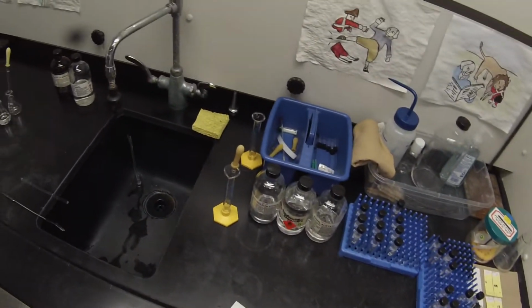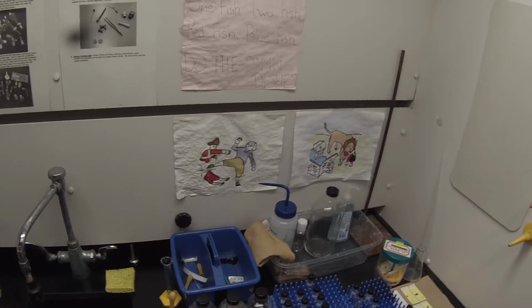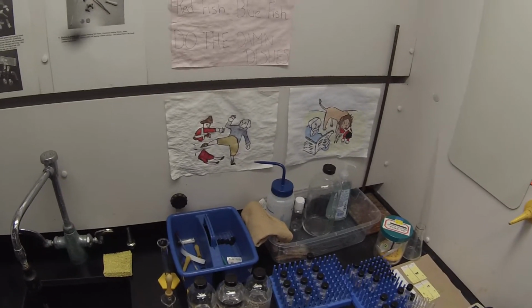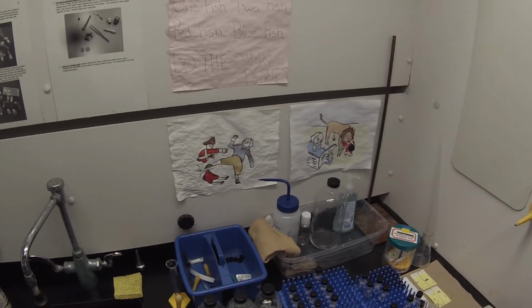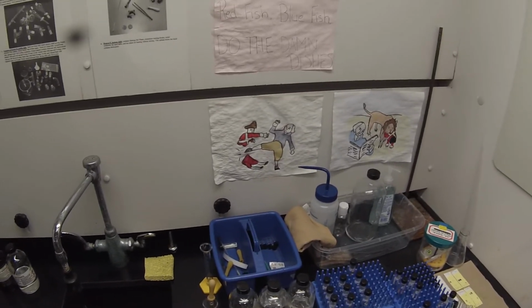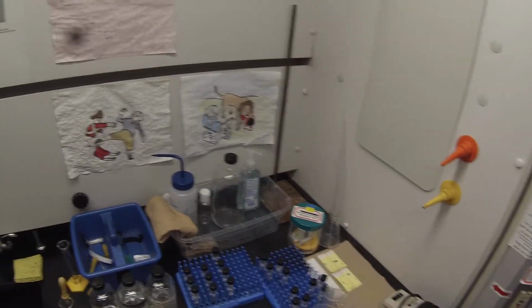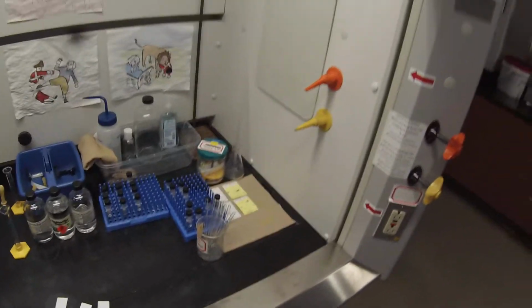And these plates have a finely divided SiO2, silicon dioxide, or silica gel, which is basically just highly purified sand. That, of course, won't stick to the plastic backing, so that SiO2 is suspended in a matrix of gypsum, which is calcium sulfate. And then in addition, there is a UV indicator on there that fluoresces under UV light, which allows the plate to be bright white.